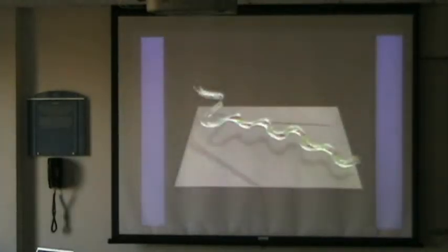And here too, you see that's a spirillum kind of bacteria. That of course should be exactly tube-like, but you see we lose this upper and the lower structures here because of that missing wedge effect.